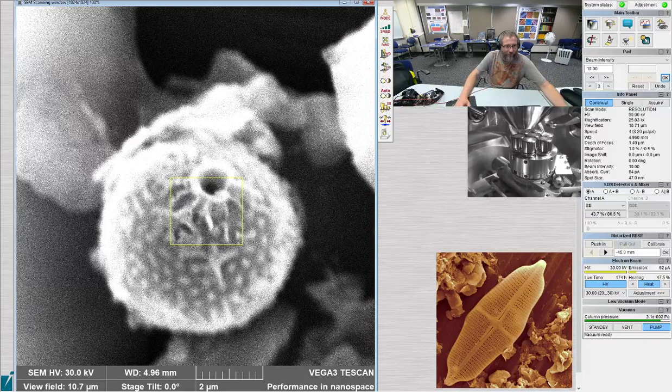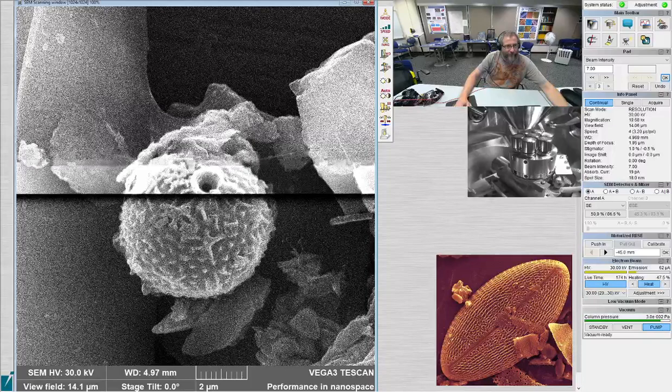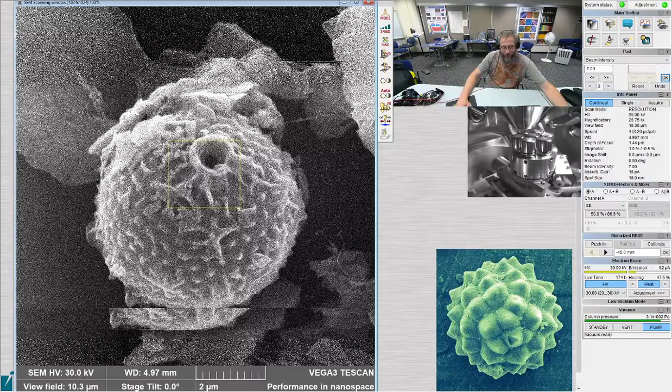Chrysophytes are not diatoms, but they are one of the closest things to a diatom, technically. If we get bored of describing diatoms from this, we probably could spend a couple of years describing chrysophytes as well, because I doubt anybody's looked at the chrysophytes here and put names on these things or numbers or whatever they're going to do. Yeah, numbers.